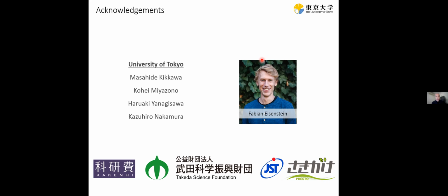But in the areas where the spot is, you have more electrons that are not contrast carrying or information carrying, so they would just add more noise to the background. So these particles are more noisy, I guess, and they probably get classified out during the classification steps. But there are not that many spots, here and there, maybe one spot per image. So a few percent, you're just losing a few percent of particles. Yeah, that's a good guess. Yeah. Thank you. Sure.